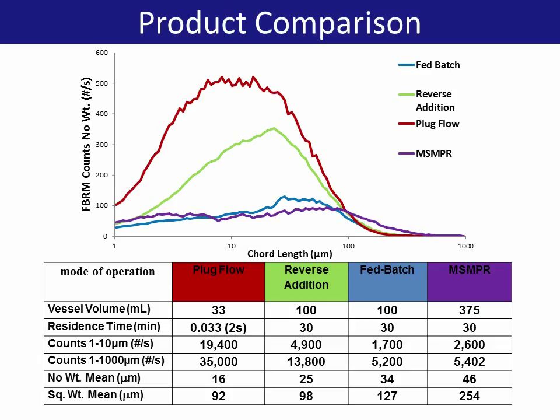For example, the same amount of material is produced on a per annum basis by the plug flow run or 42 10,000 litre batches. This can be achieved using a 9 litre MSMPR crystallizer also, and assumes that 300 days of operation per year are conducted.